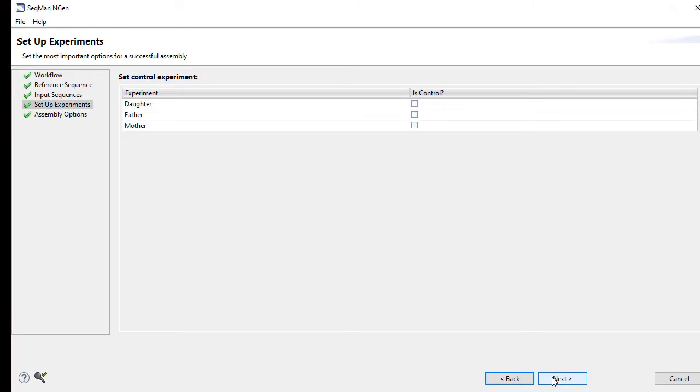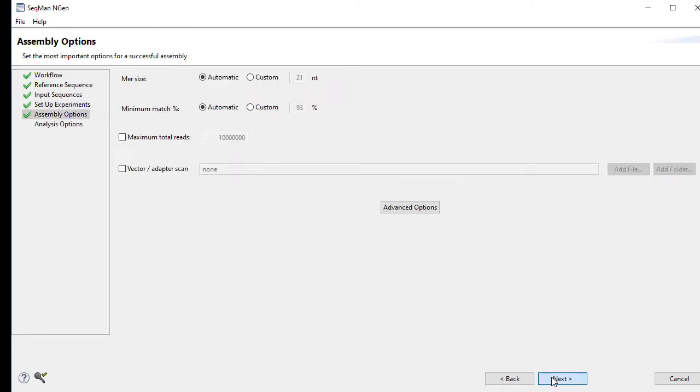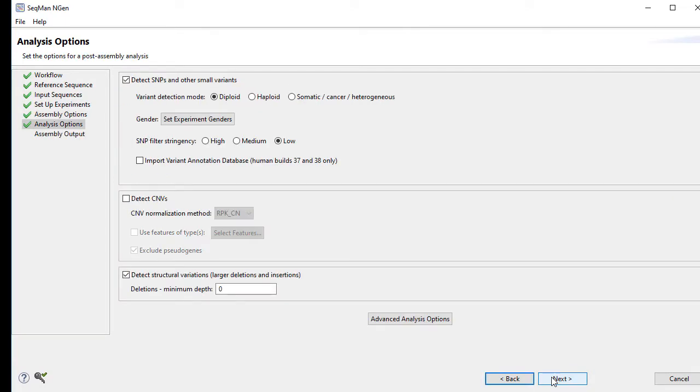Next, set a control experiment if you have one. I don't, so I'm going to skip this step. Then review assembly options. In most cases, these can be left at their default settings.